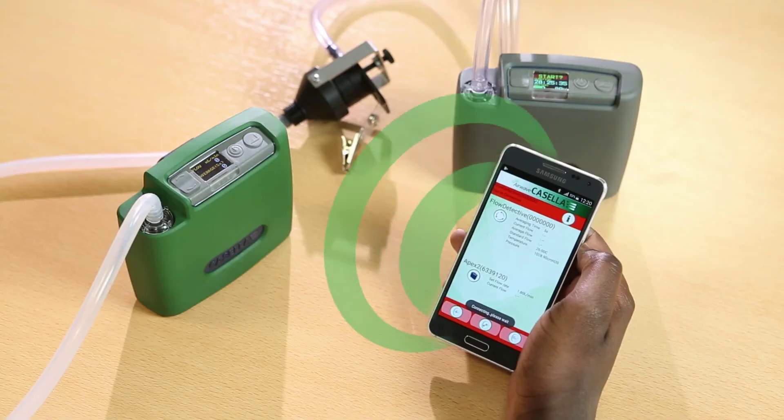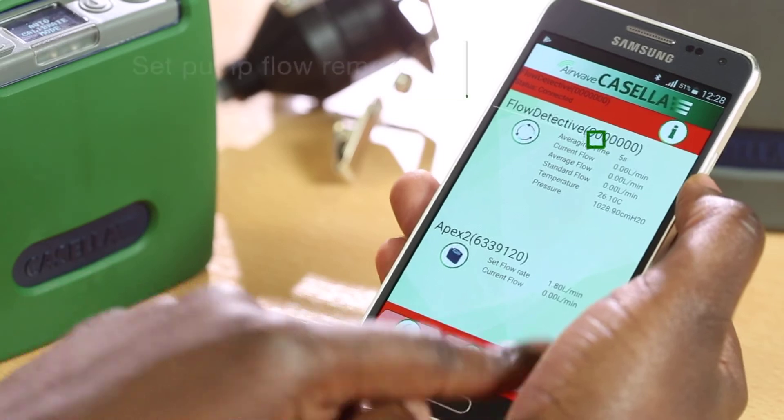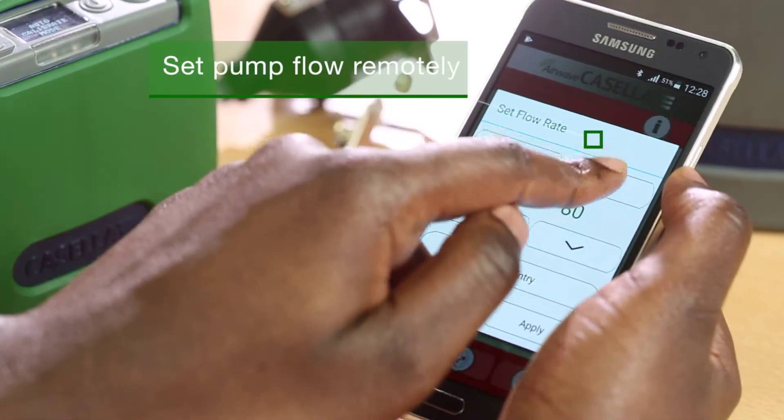This means nothing needs to be set on the Apex 2, again saving a lot of time in setting up your pumps.